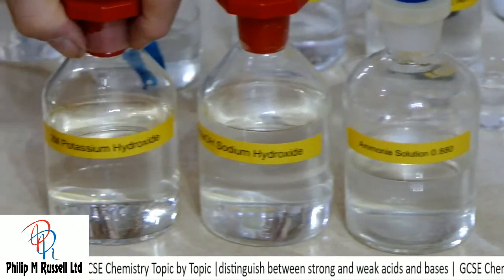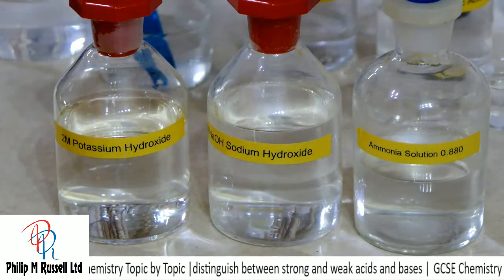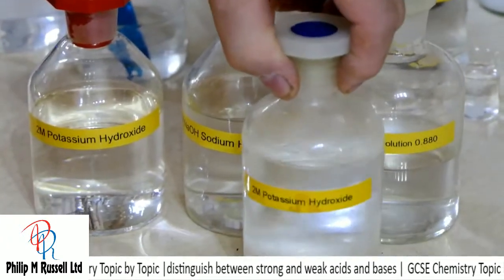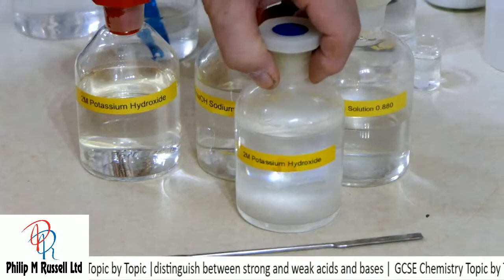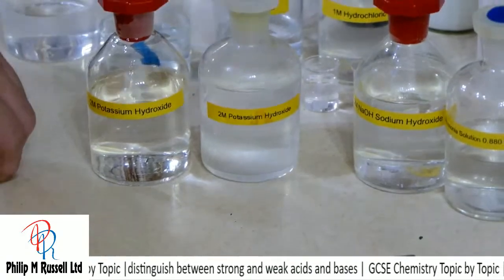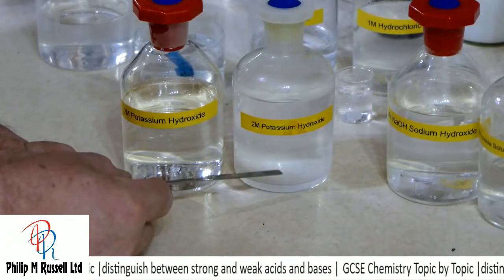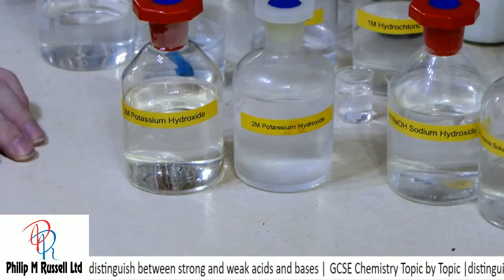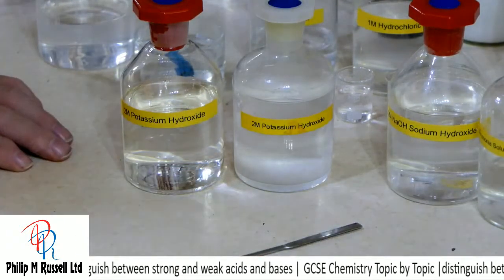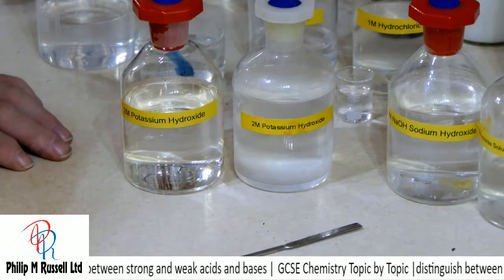We've got potassium hydroxide. Now, the reason I was panicking there was my potassium hydroxide, when I got it out, actually looked like this. And you can see this potassium hydroxide looks a bit different than the other one. And we can see that down the bottom we've got some stuff come out of solution. And so we had to go and make some more up, because this doesn't seem to have a very good shelf life. Basically, some of the potassium hydroxide seems to come out of solution.